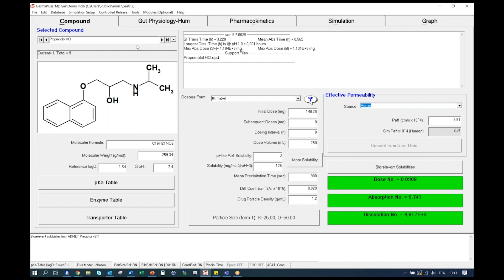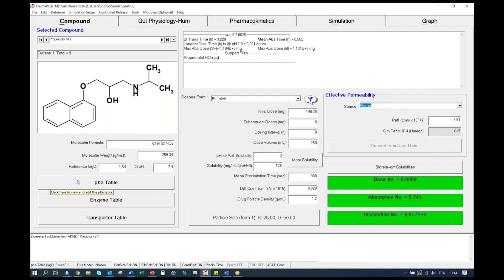Now let's focus on the compound tab. First, you can see that the molecular structure is presented here on the left. On this tab, you will enter all of the information related to the physicochemical properties of the API, such as molecular weight, log D, and pKa. You will also enter all of the in vitro information for solubility versus pH, in vitro transporter and enzyme measurements. Integration of these parameters into the software will be presented in the following videos.